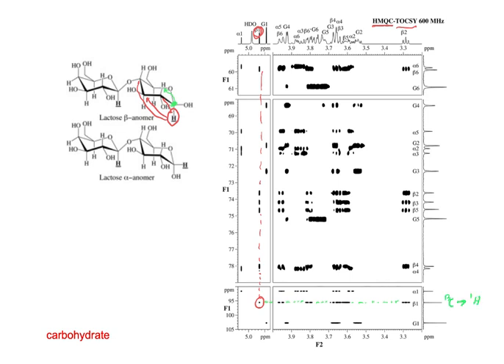And in this direction over here, we are going from the proton to all the carbons. Right, and we can see that from each one.